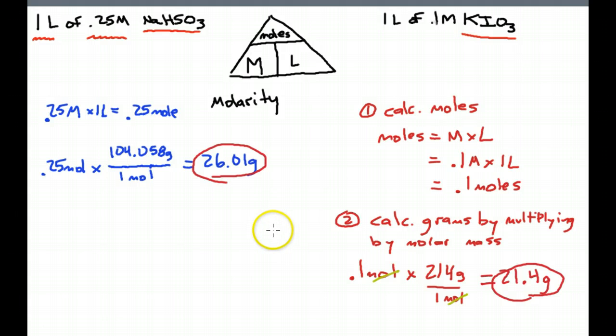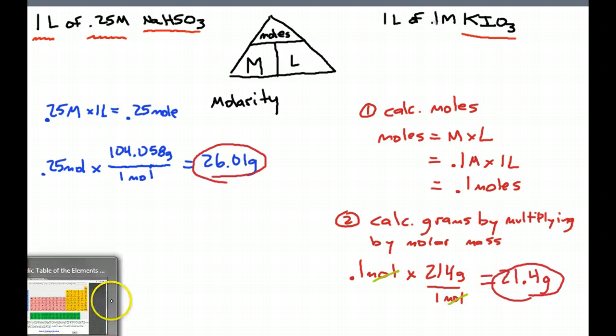ratios and things to make this reaction go. You would dilute these down with some water a little bit, add some starch in there, and it's the reaction between these two with the starch that's going to create that iodine color. Another real fun thing that you can do with this, if I actually got the solutions to work in class today, you would have seen it done this way, and I'm going to show you another one.